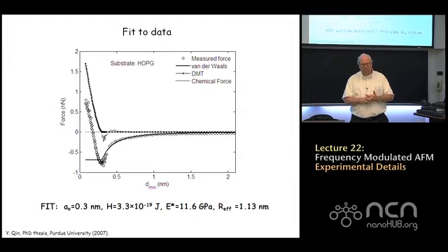Yeah. So when they do atomic resolution images and so forth, is that normally in air or liquids? So in FM AFM, the primary community is ultra-high vacuum academics.